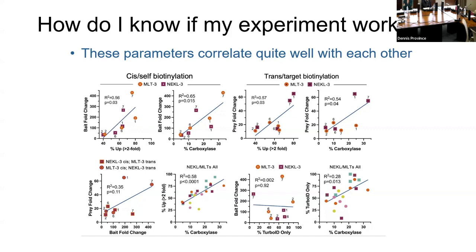That may be related to your estimating a fold change from not seeing it to seeing it. So I didn't do that for these. I didn't use anything where I made up the number. Okay. Could it have to do with the amount of each of the proteins? It totally could. All this variability, is it my worms? Is it the prep of the worms? Is it something to do with the mass spec, or is it all three? Probably it's all three, right?